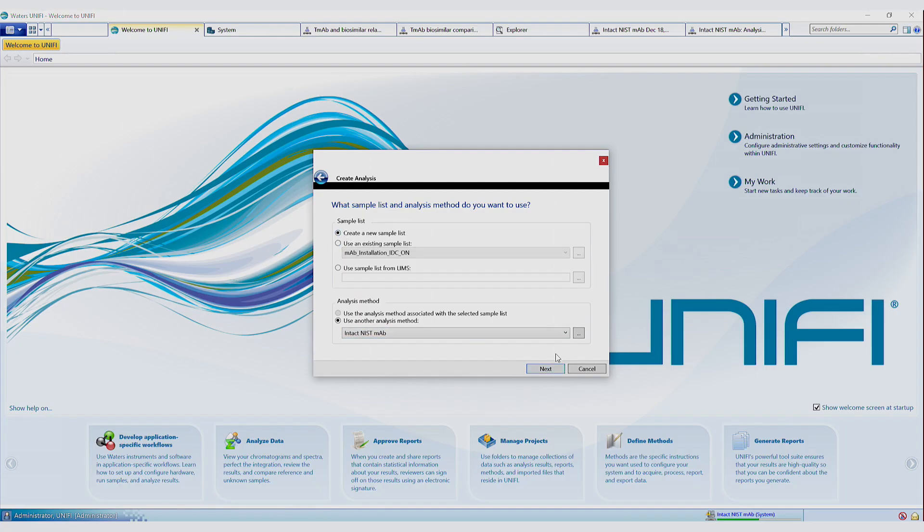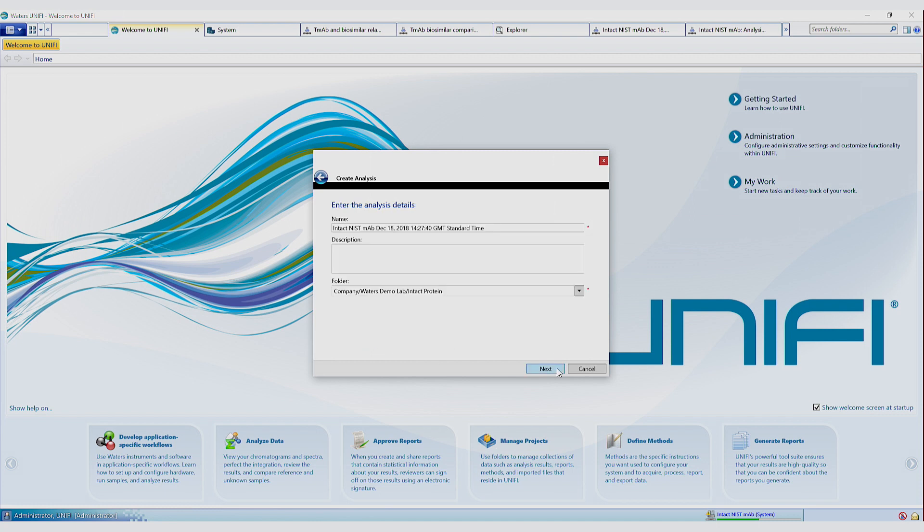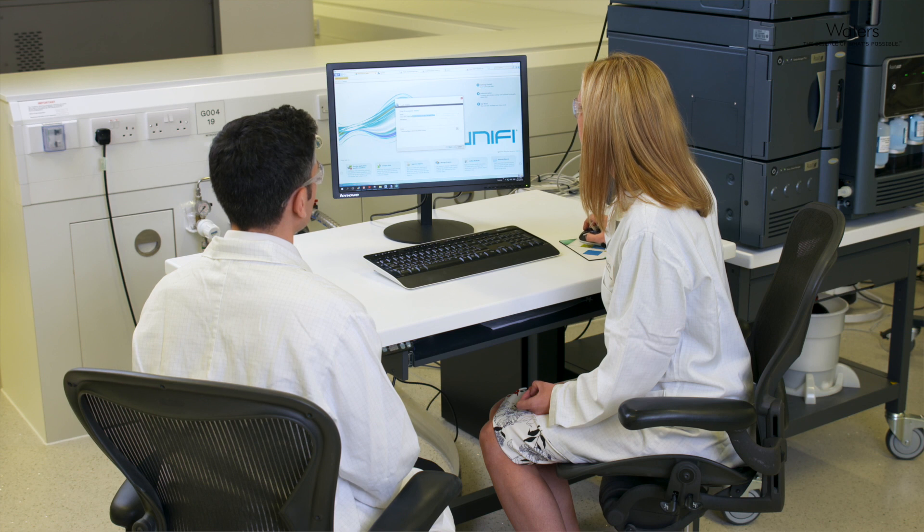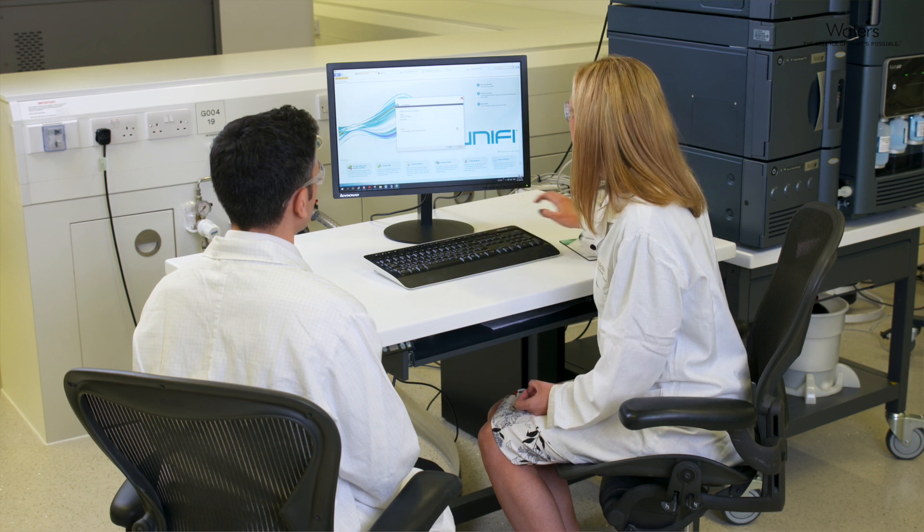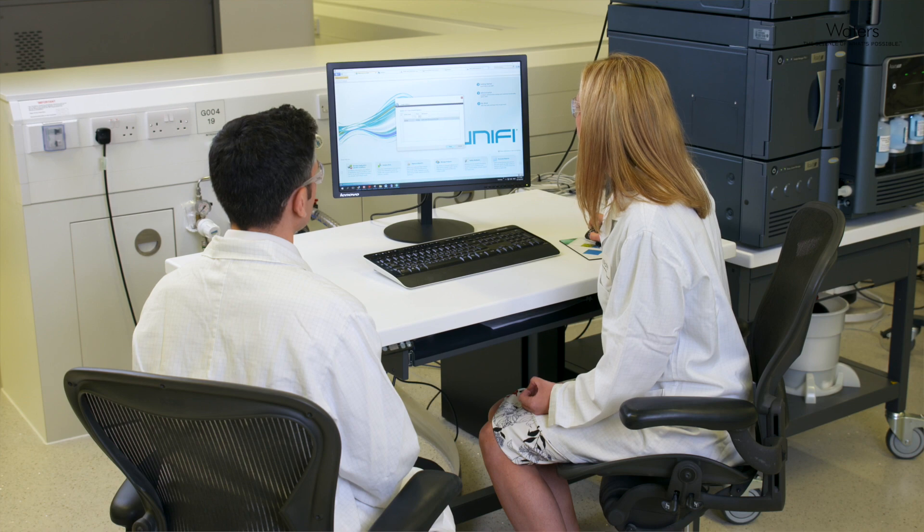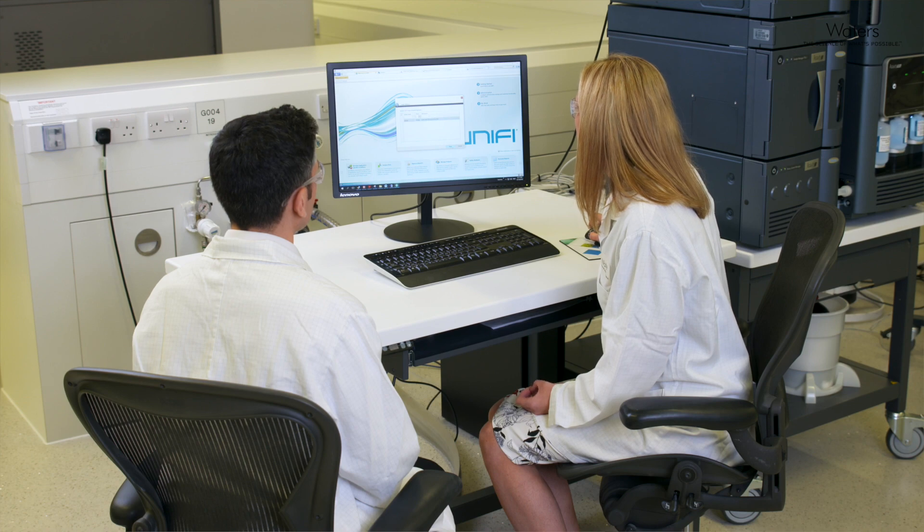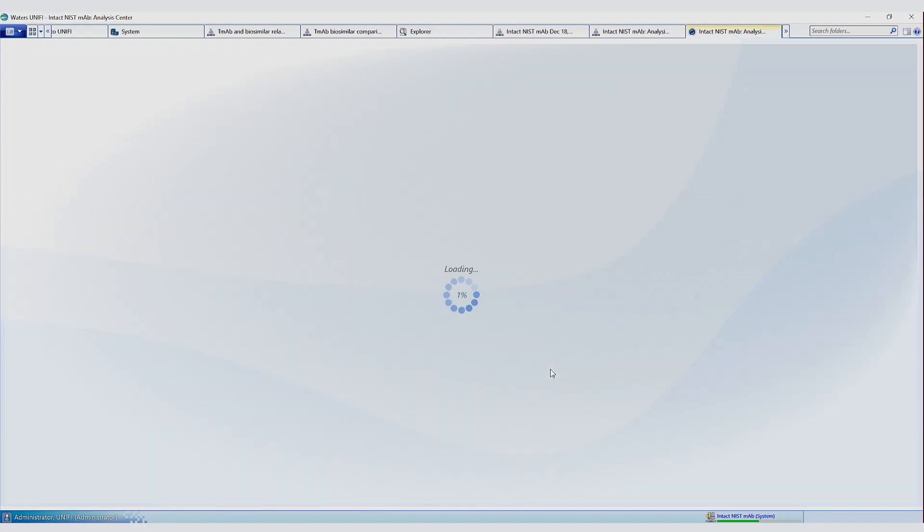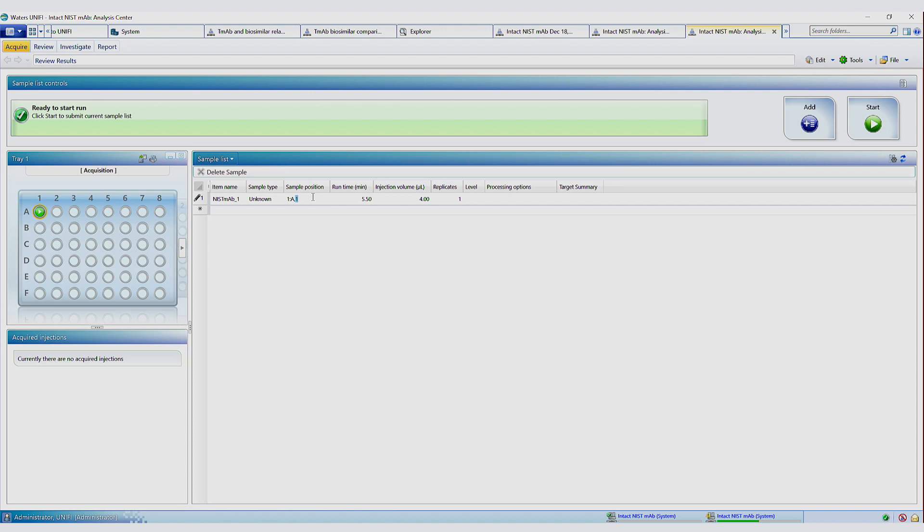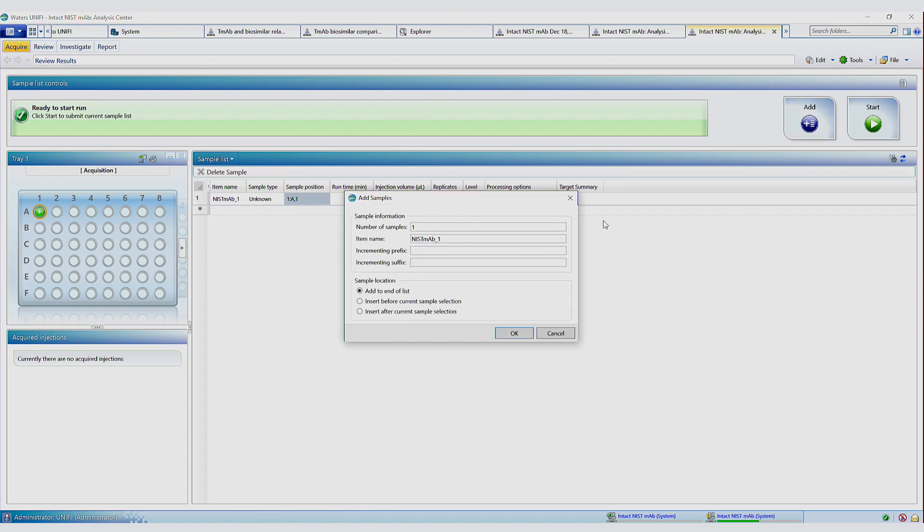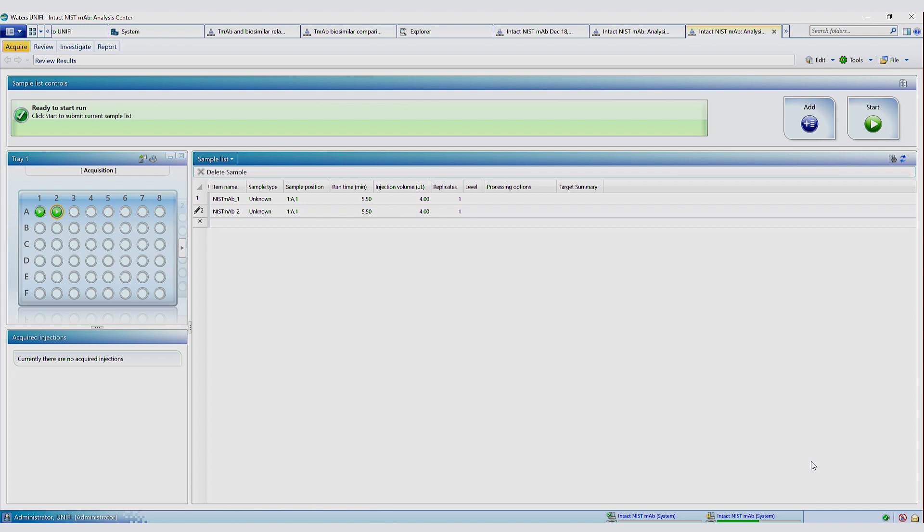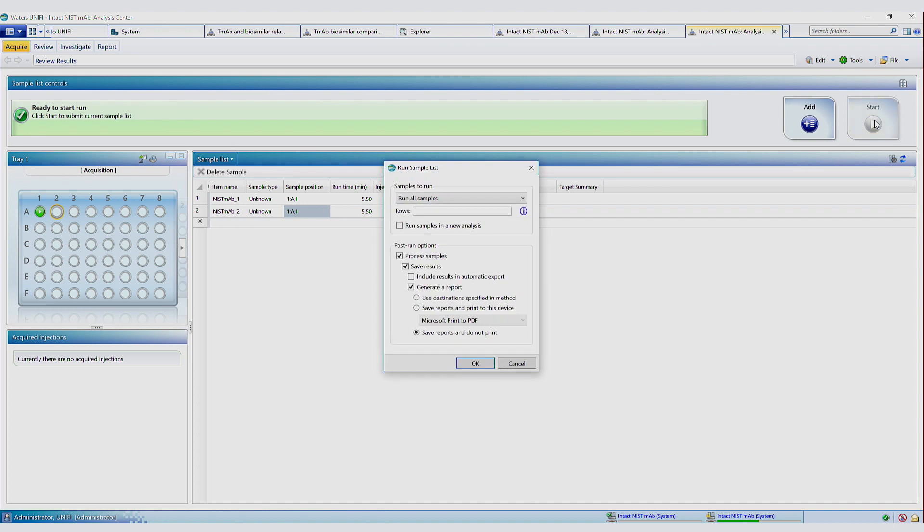I'm going to create a new sample list and use an intact MAB method. And then give the file a name. Choose the online system. And then we just need to populate the sample list and press go. So we're going to inject NISMAB twice. We're going to set the first injection to be a reference so we can do a comparison. We're going to inject four microliters of the NISMAB. So once that's all set up, it's just a place of pressing go.